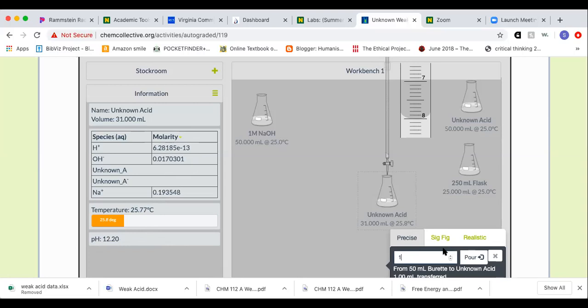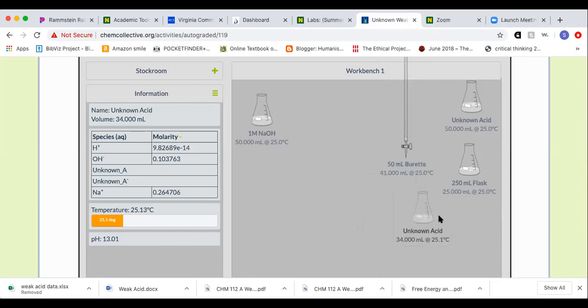And so again, the end point here, and the point of this titration curve, since we don't have an indicator, you want to go past this a little bit. In the write-up, it says about 2.55 is where you want to go, but you probably want to go at least a few milliliters past the end point. Here I've gone up to 2.87, and then one last aliquot, and now I've reached pH 13. That would give you a very gross graph done by 1 milliliter, so it's not going to give you a lot of great data at 1 milliliter.